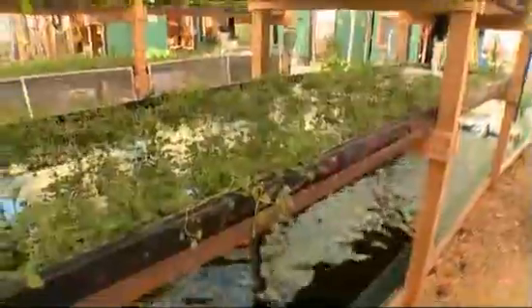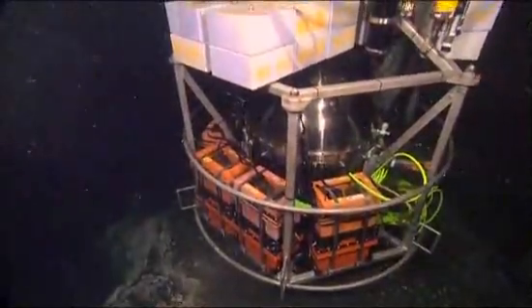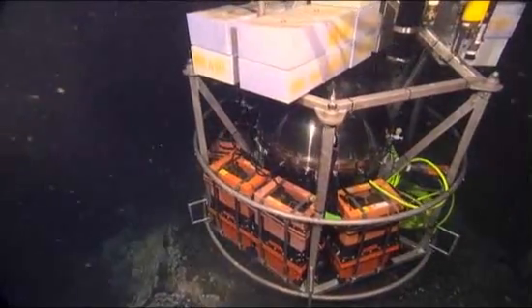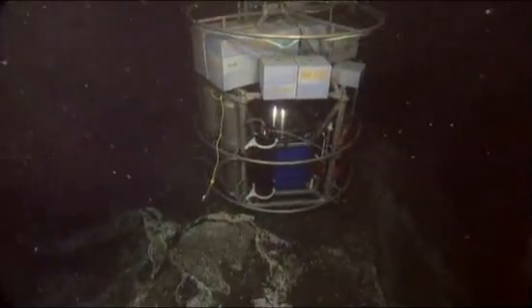All people who do aquaculture have to test water every day. Chris Newman is testing ESP at his fish farm to see if it accurately detects bacteria in his tanks. Water quality testing takes an immense amount of time. If you get it wrong, a whole bunch of fish can die on you. Now Scholin's team is working to pair ESP with an autonomous underwater vehicle so it can go mobile. You might call it Lab in a Can 2.0.